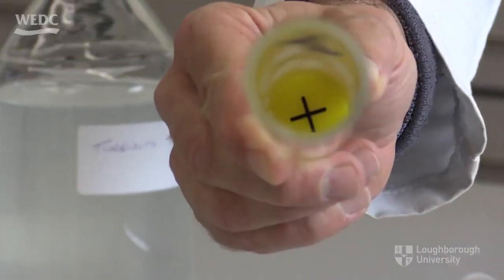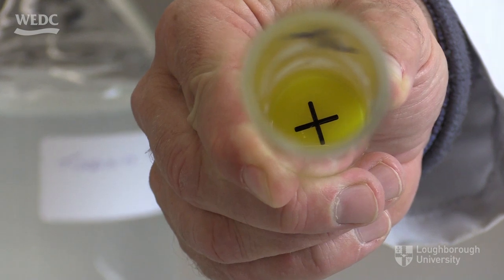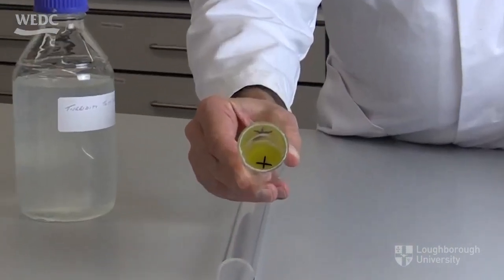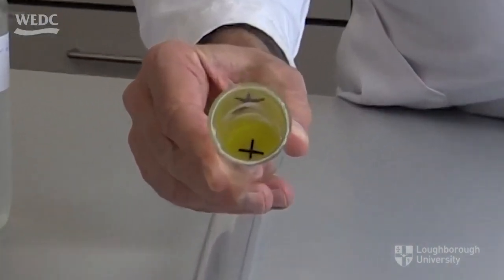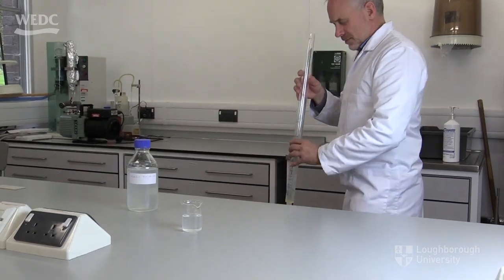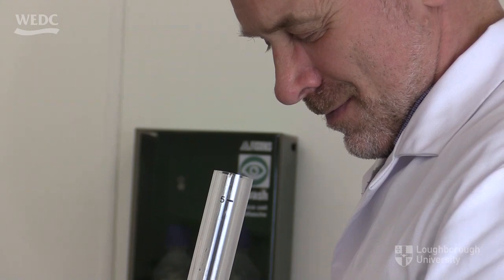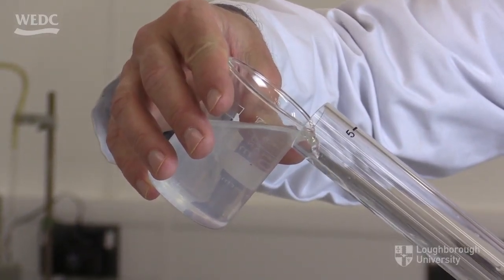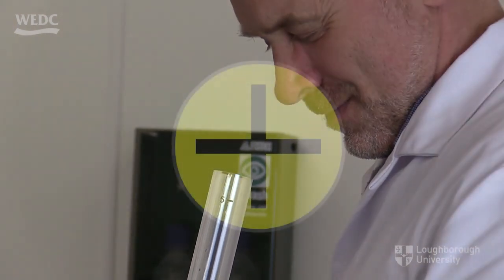An important component of a turbidity tube is a black cross or a circle marked on a yellow or white background located inside the tube at the base of the lower section. The way we measure turbidity is simply to see at what level the cross or the circle becomes invisible to the naked eye by adding incremental amounts of turbid water into the tube until this point is reached.